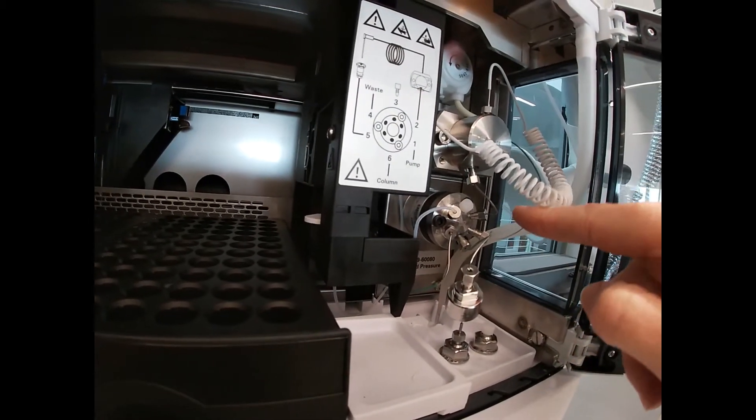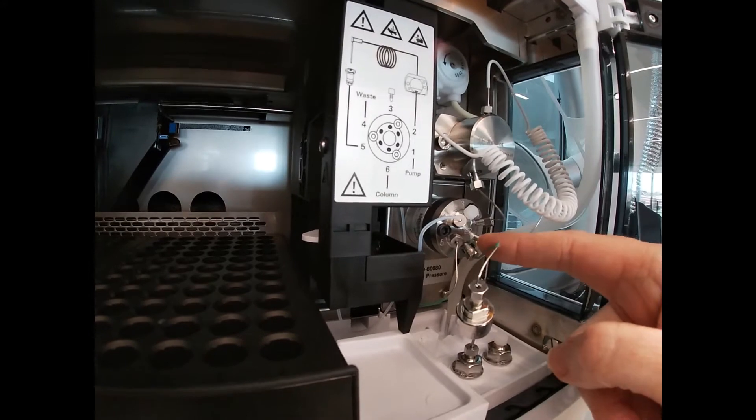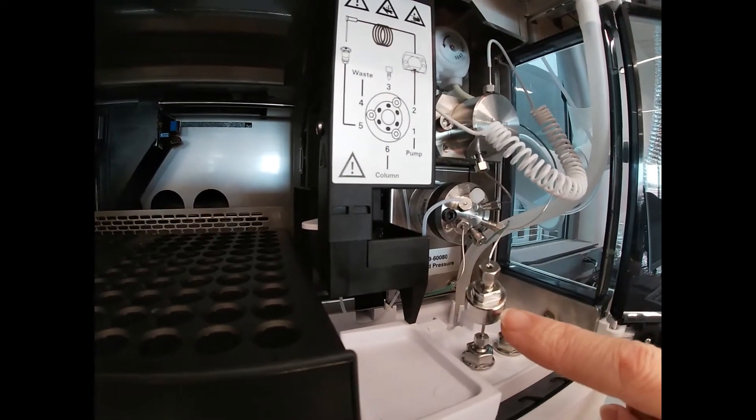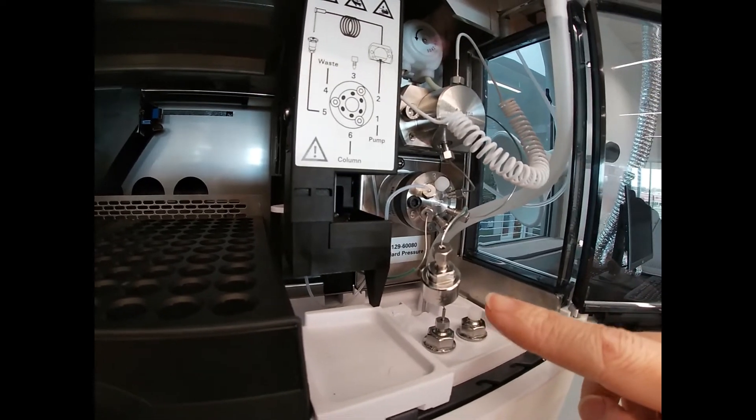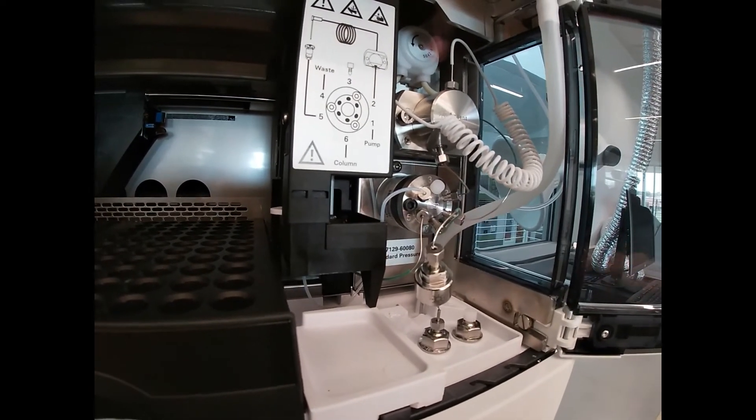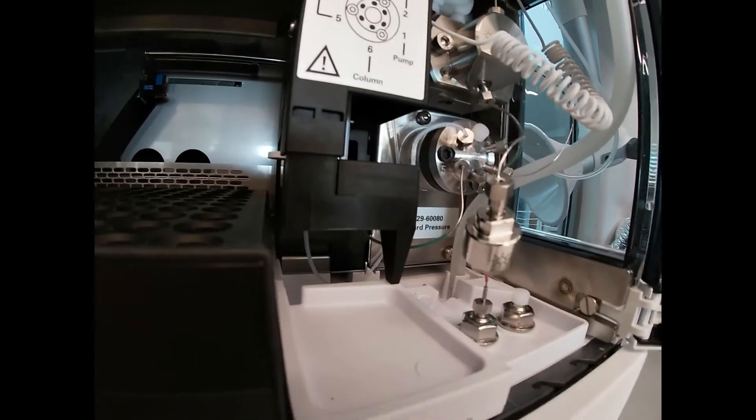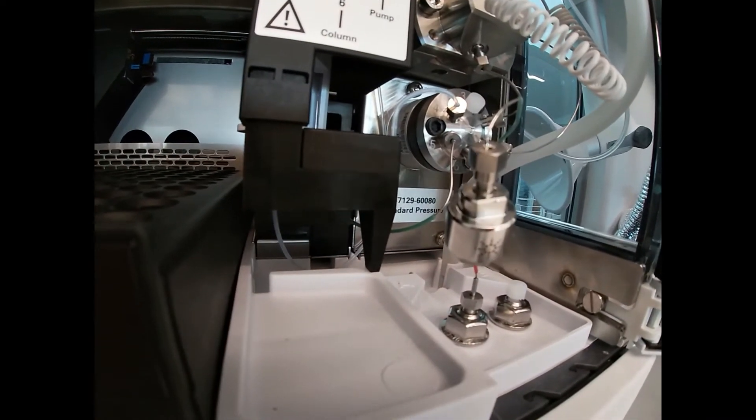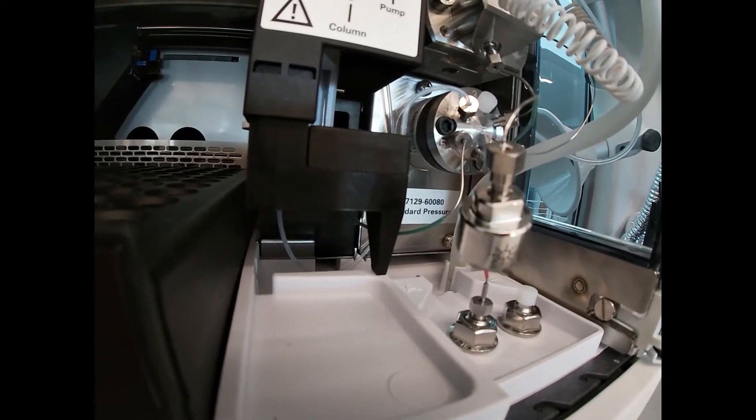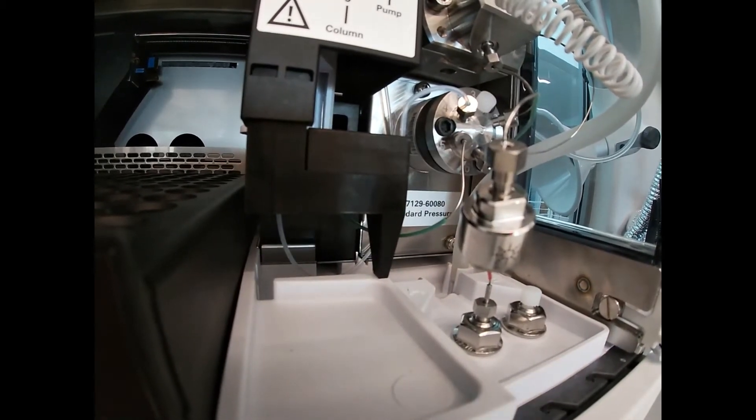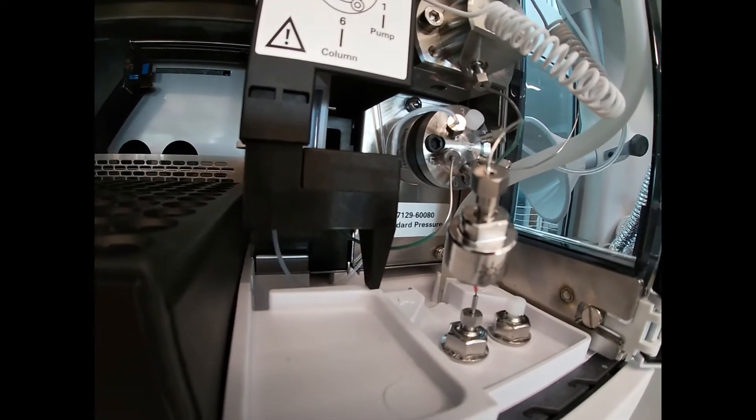Our flow line comes down here and passes through a little pre-filter. This pre-filter filters out any particulates that may have gotten through our filtration beforehand. This is called high performance liquid chromatography—it's also high pressure because we have very small particulates within our column and we don't want to get it plugged up.